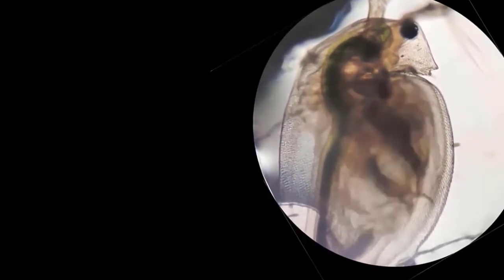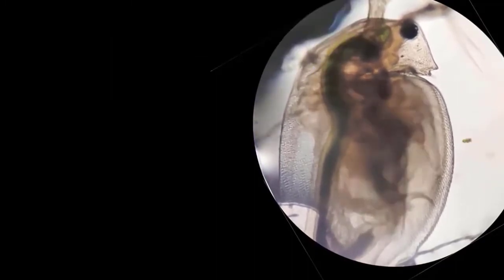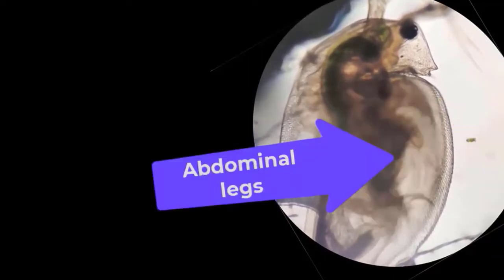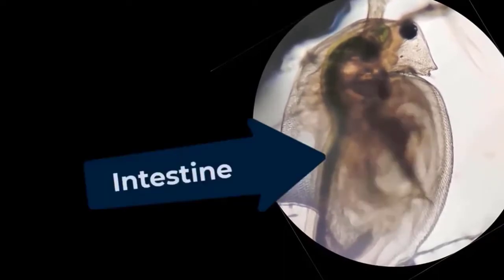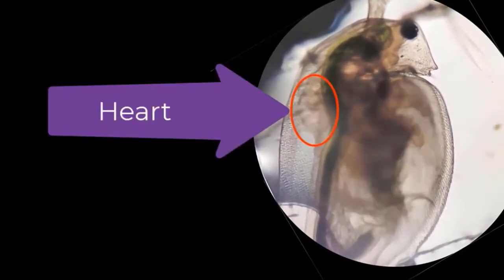The reason we have chosen Daphnia is because it has a transparent body. This is its compound eye. These are its antennae. These are abdominal legs. The intestine and the heart, as you see here, is located at the back of its body.